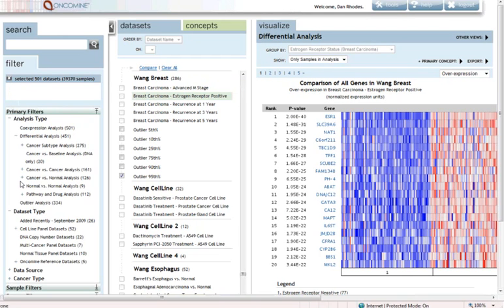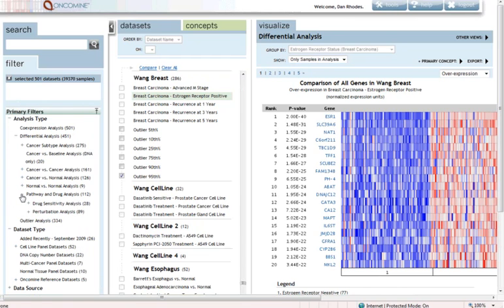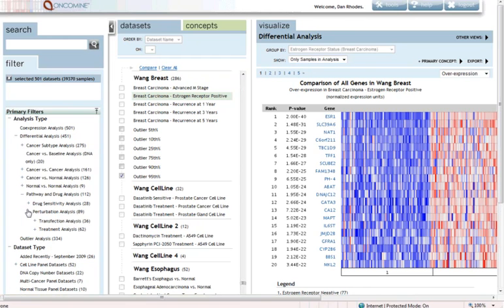We're going to focus on gene signatures that are representative of pathway activation. As you see, I'm navigating in the tree here to select, in particular, perturbation analyses.